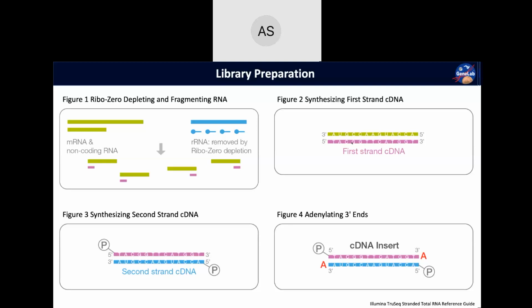And so you had some reads aligned in one direction, some reads aligned in other directions. And then when people were quantitating, some people were quantitating reads only aligned in a certain direction. Other people were quantitating reads aligned in a different direction. And other people were quantitating reads no matter what direction it was aligned to relative to the reference genome. And so this is another way to standardize things to reduce the variability when you repeat experiments.